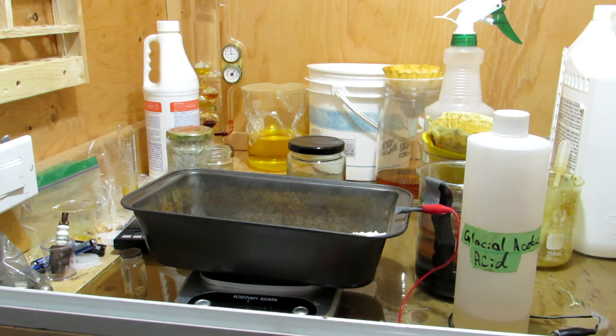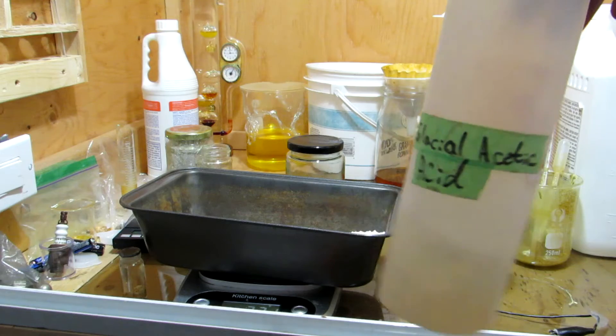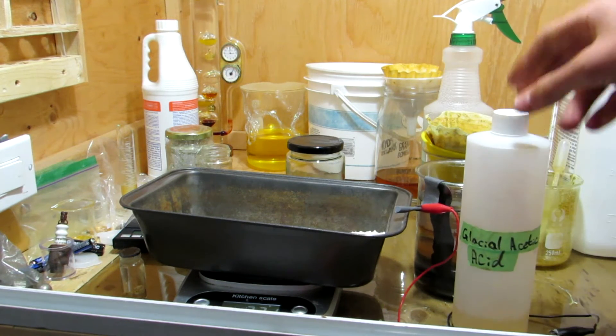Acetamide can be made fairly easily from urea and glacial acetic acid. Urea is found in fertilizers and some cold packs. I also showed how to make glacial acetic acid in a previous video — it can be simply done from sodium acetate and sodium bisulfate.